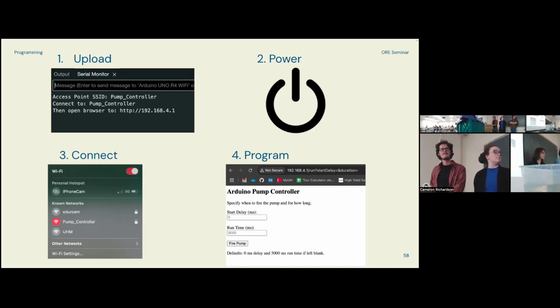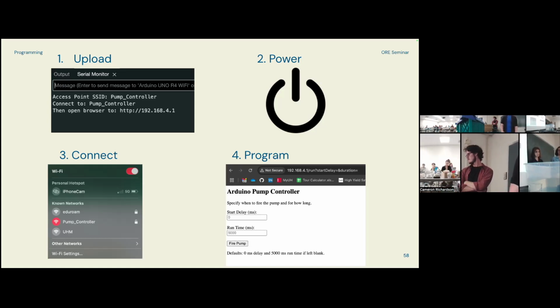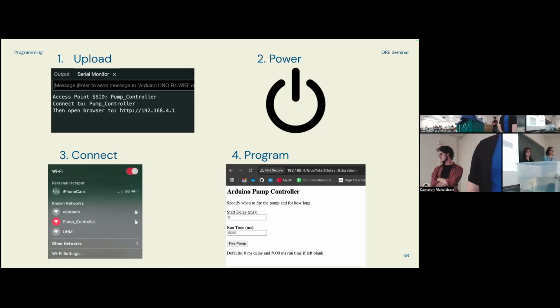Yes, I reached out to our collaborators and they said they would ideally want the 0.4 micrometer EC membrane filter, which is the one we showed in the first video, which ended up having a very low flow rate. So that would ideally be the design criteria. Different materials will filter differently and give us different filter rates, so that's something to test in the future.